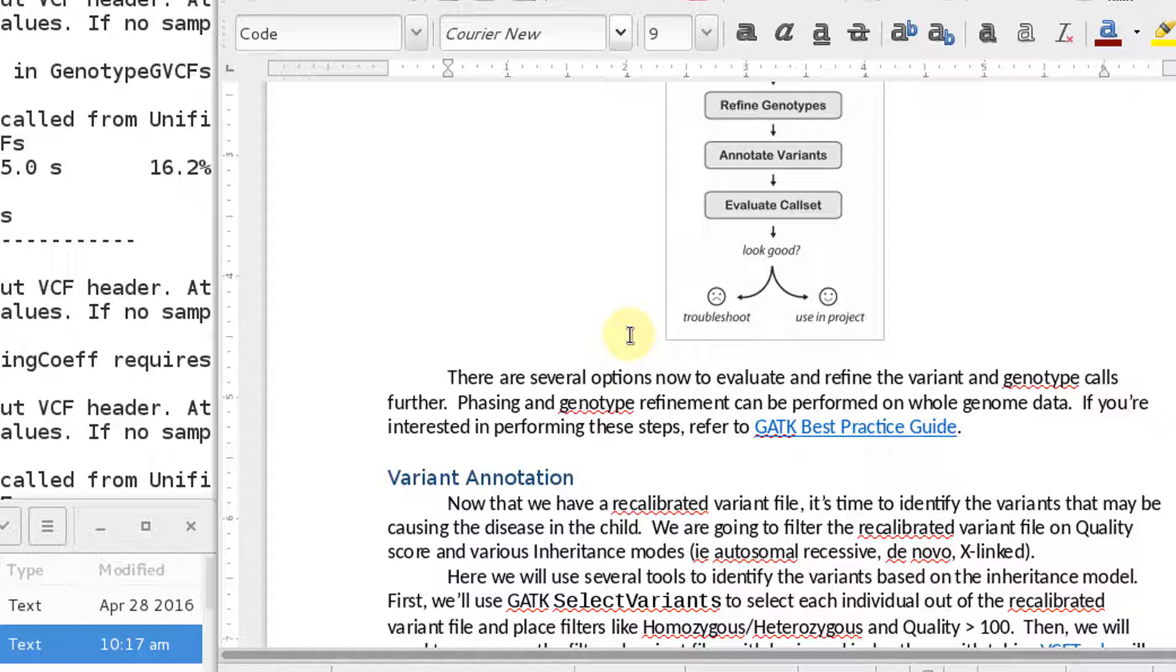So you need to annotate your VCF file. If you were to open up that VCF file that you just created, you would see that it's just full of chromosomal locations, start, stop, the base that it was, and the reference quality scores, things of that nature.